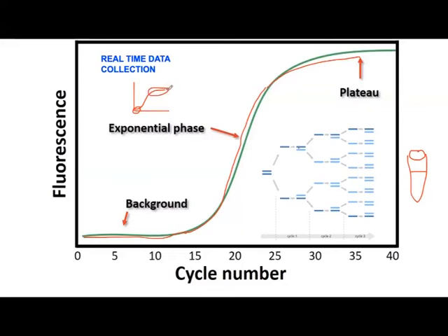And this is a problem you get in flow cytometry, in ELISA, that when you have too much fluorescence, the machine or the detector that you have in your plate reader or in your fluorescence detector cannot tell the difference. So that's why we have this S curve. And usually in the data analysis, we look at the exponential phase of the PCR for the detection. So that's basically SYBR Green. It's the first molecule that we want to talk about.